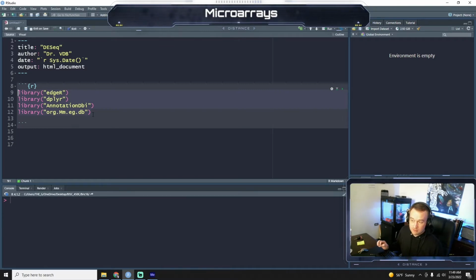We have 4 packages that we need to install. EdgeR is our differential gene expression package of choice. We will also be doing DESeq in another series of videos. You're all familiar with dplyr by now. AnnotationDbi is to annotate our genes, and previously for the microarray with BRIC, we used the Arabidopsis database.